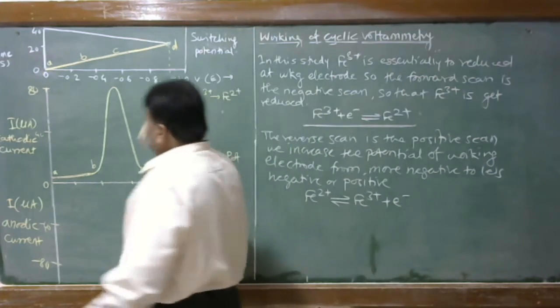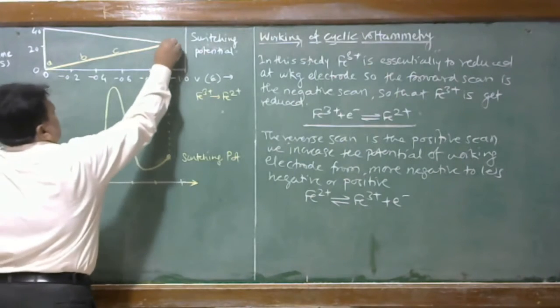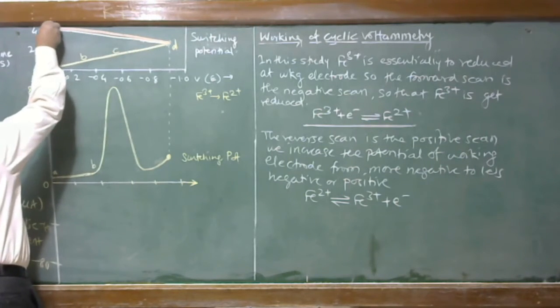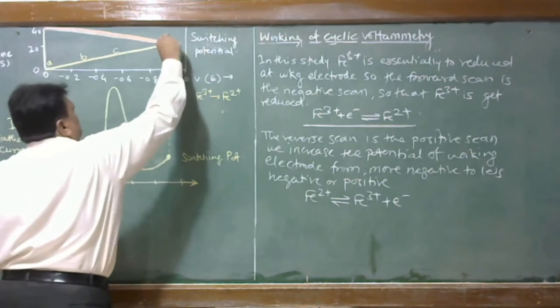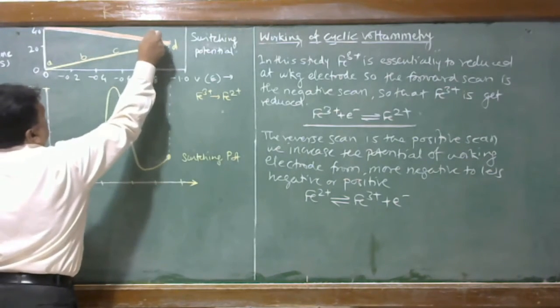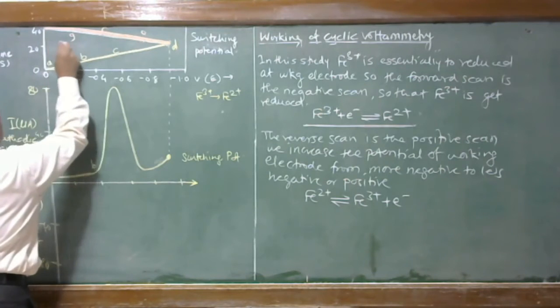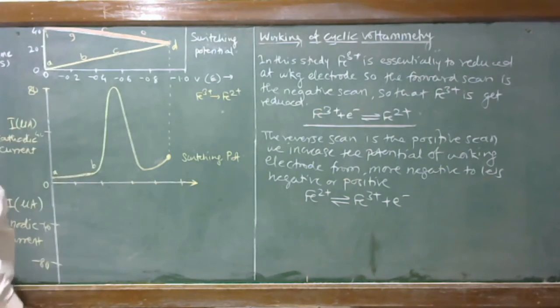That means here in the second case we can switch the potential from this value to this value, to again the original 0 value. Now during this, what happens here, again we have here E, here F, here G, I.